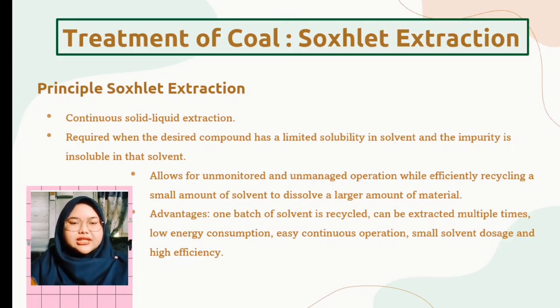The advantage of Soxhlet extraction is that instead of many portions of one solvent being passed through the sample, just one batch of solvent is recycled. It can be extracted multiple times, with low energy consumption, easy continuous operation, small solvent dosage, and high efficiency.